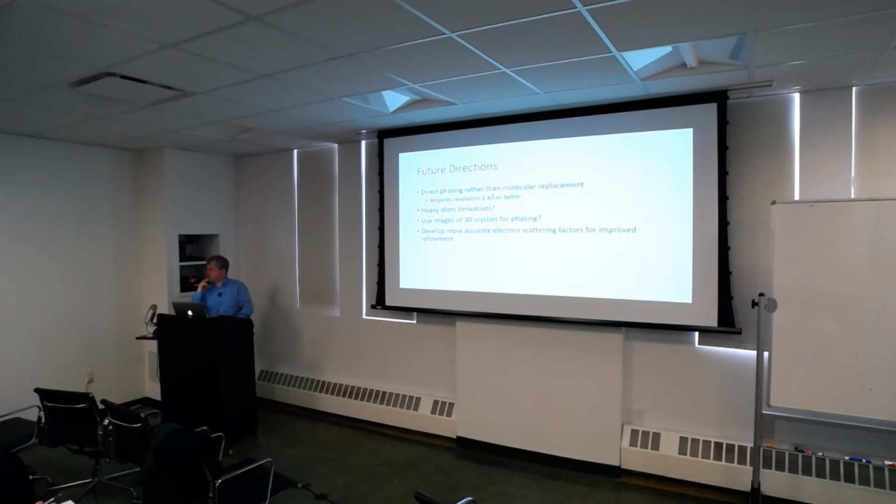Maybe if you have an energy filter, you might be able to do something clever and pick up some anomalous signal that way. But I'm not sure. Actually, you're right, it will be different, because the scattering you're getting is from different things. With X-rays, it's scattering by the electrons. With EM, you're scattering electrons. So you're right. Have you heard of an atomic form factor for EM, like you do in crystallography? No, right? Okay, they have figured it out already. Is there an imaginary component to that form factor?